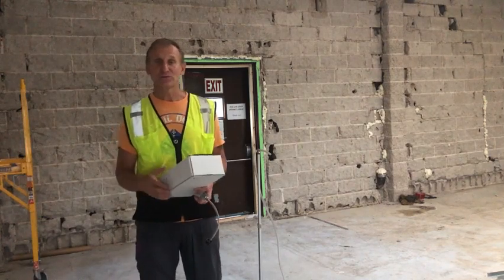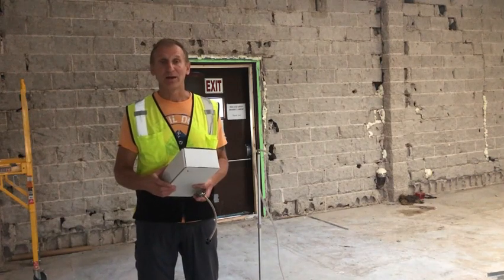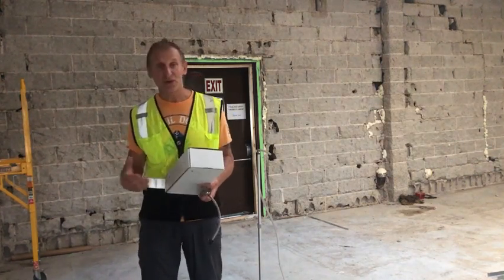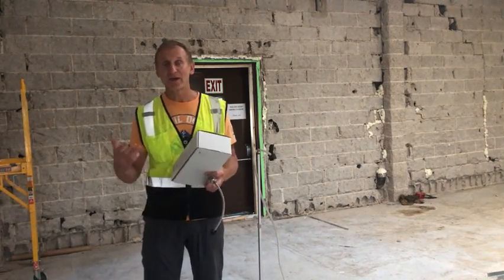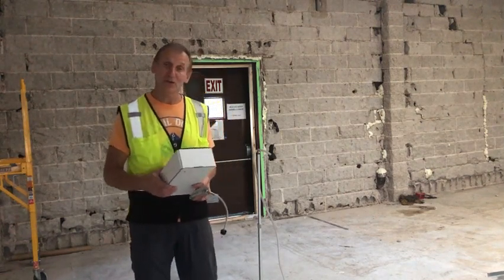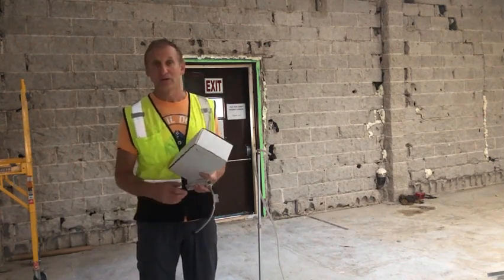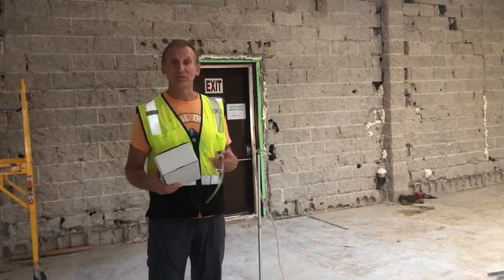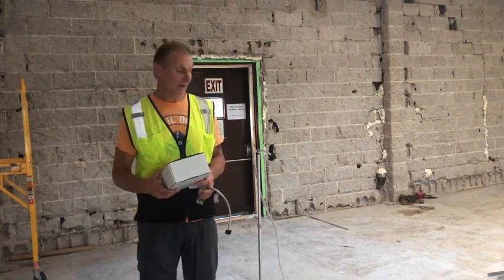I'm in a warehouse which is under construction, and the owner of the place is concerned about asbestos which might be incidentally disturbed during the construction process. So he wants us to check the air for asbestos fiber presence. As we know, asbestos is a form of mineral which quickly becomes airborne under disturbance. So they believe they have some asbestos fiber in the air. So how can we do it?